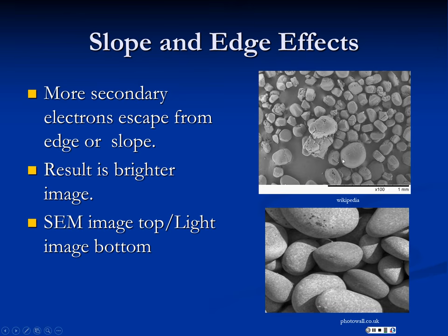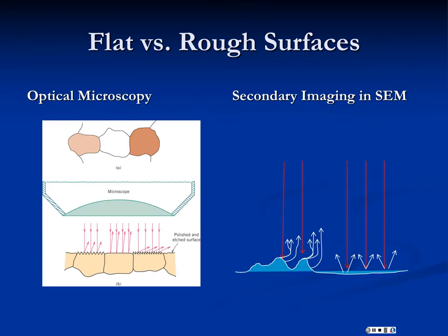So interpretation, your brain instantly does it. It's amazing. Your brain is an amazing tool. It makes sense of this picture. But when you're looking and trying to identify whether something's a hole or a hill, sometimes you need to think through where is it bright, where is it dark. So to test your skills here, we'll highlight this as well.